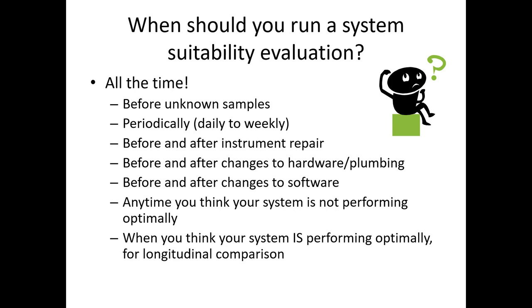I bring up the software because these instruments are delicate analytical instruments that are like hunks of metal with voltages applied, that have really tight specifications on measurements of the electrodes and the hunks of metal inside, and everything is controlled by software. So you press a button on the computer and a series of things happens over on the instrument.